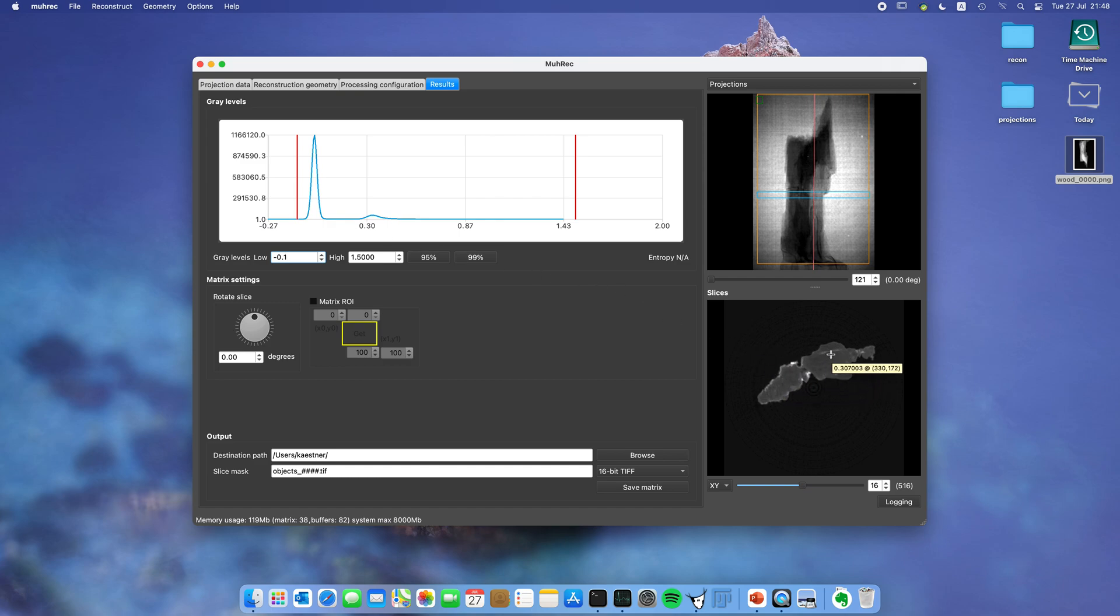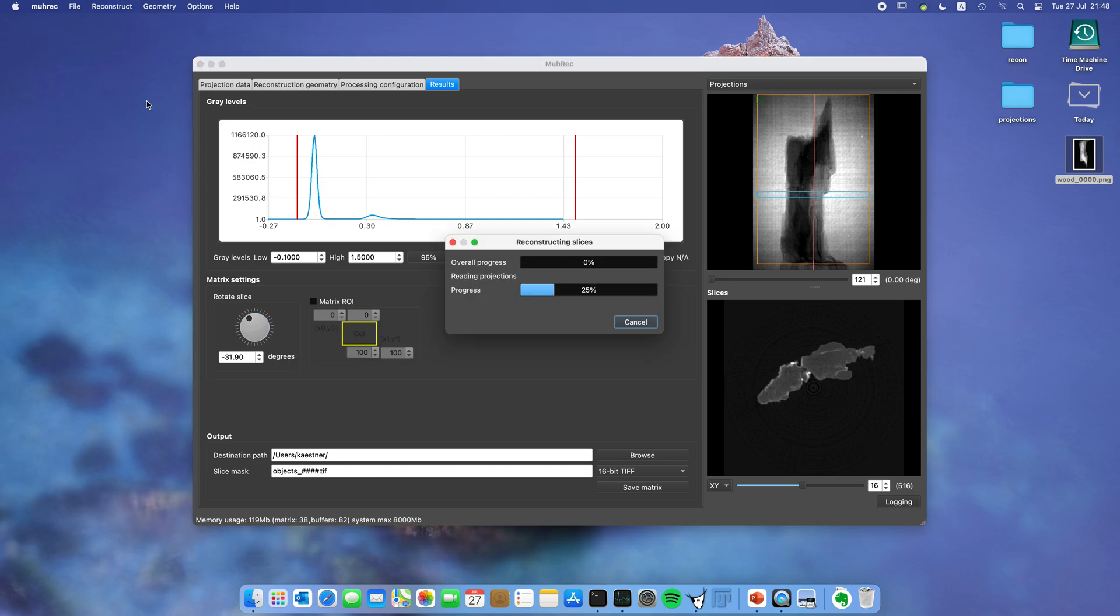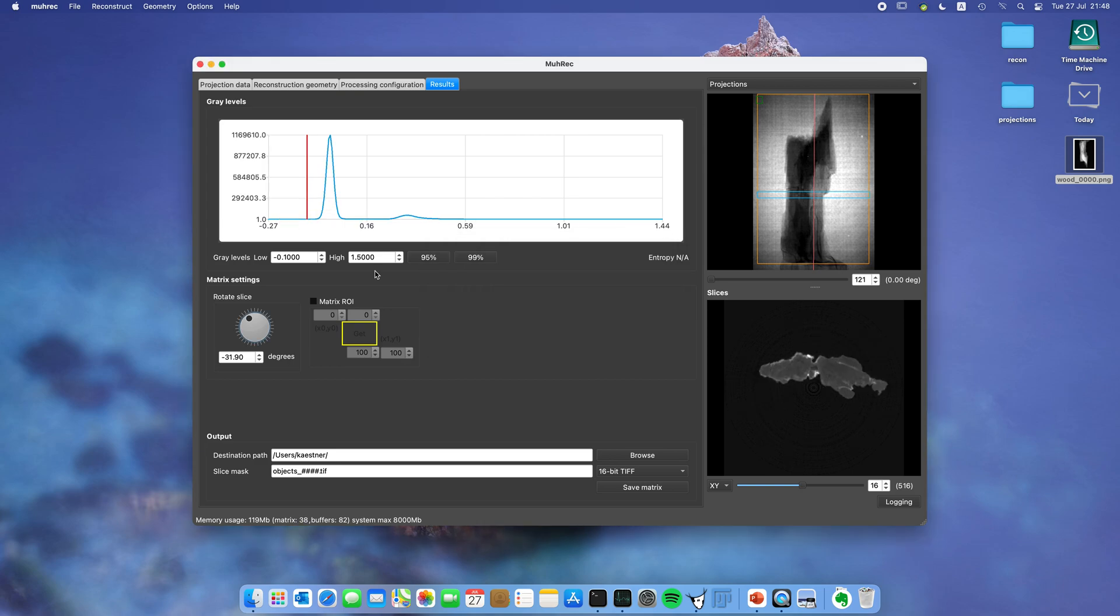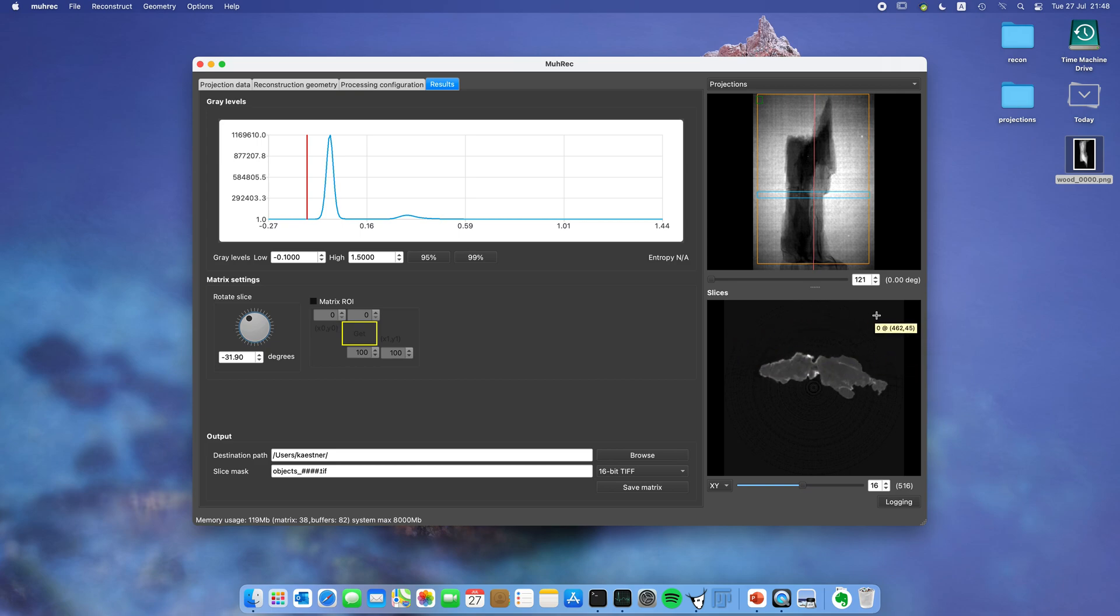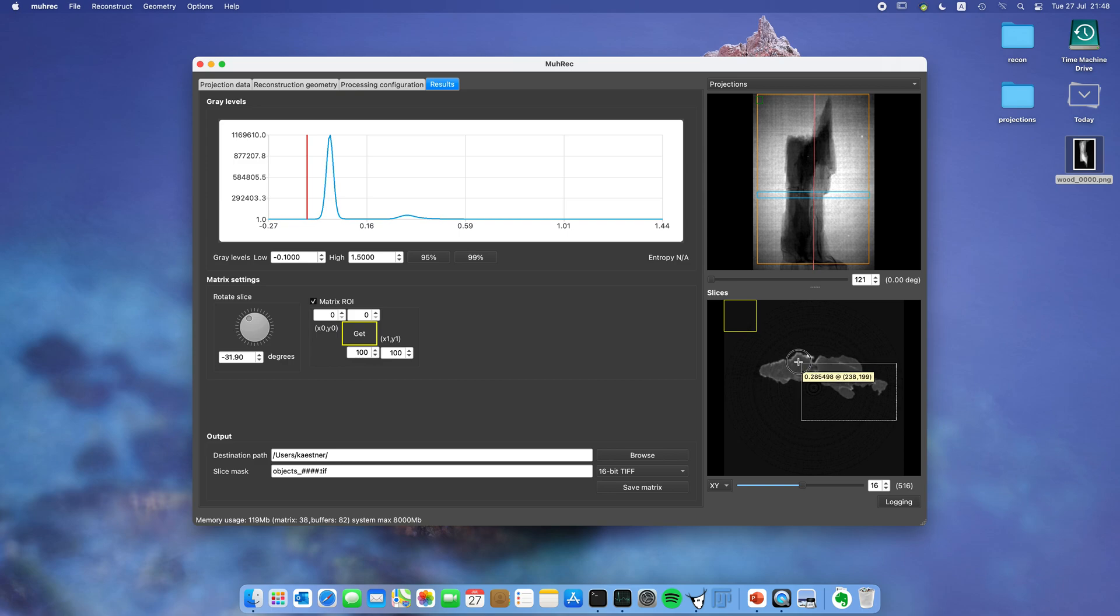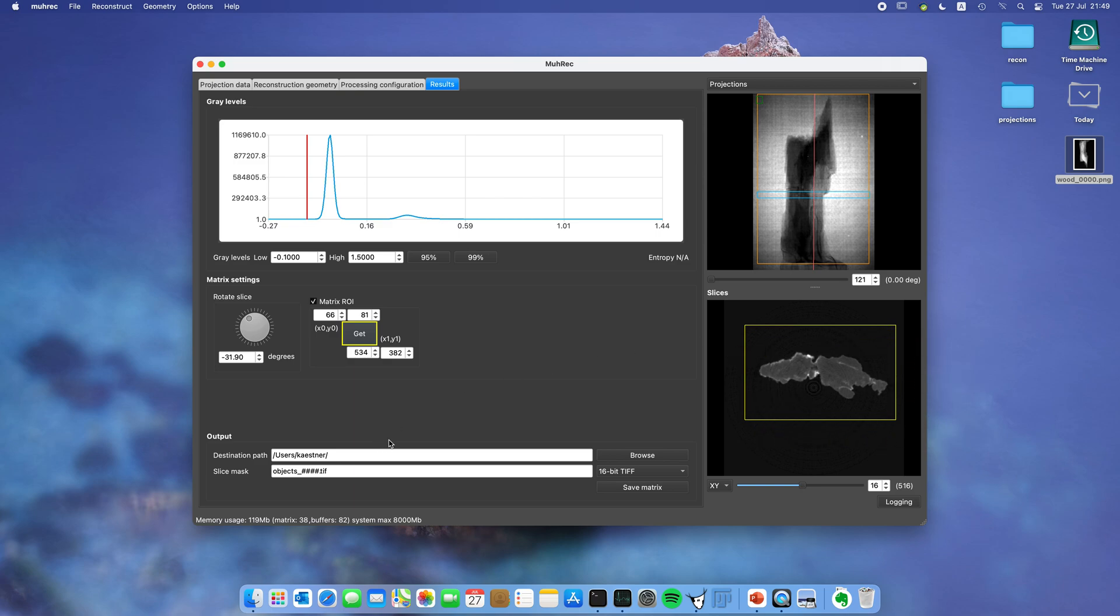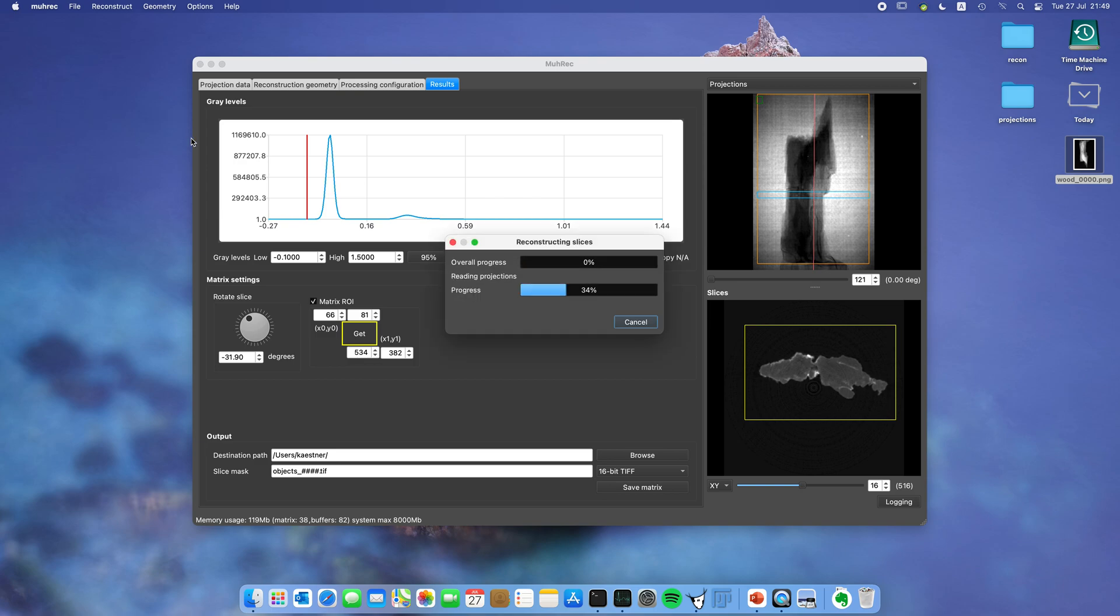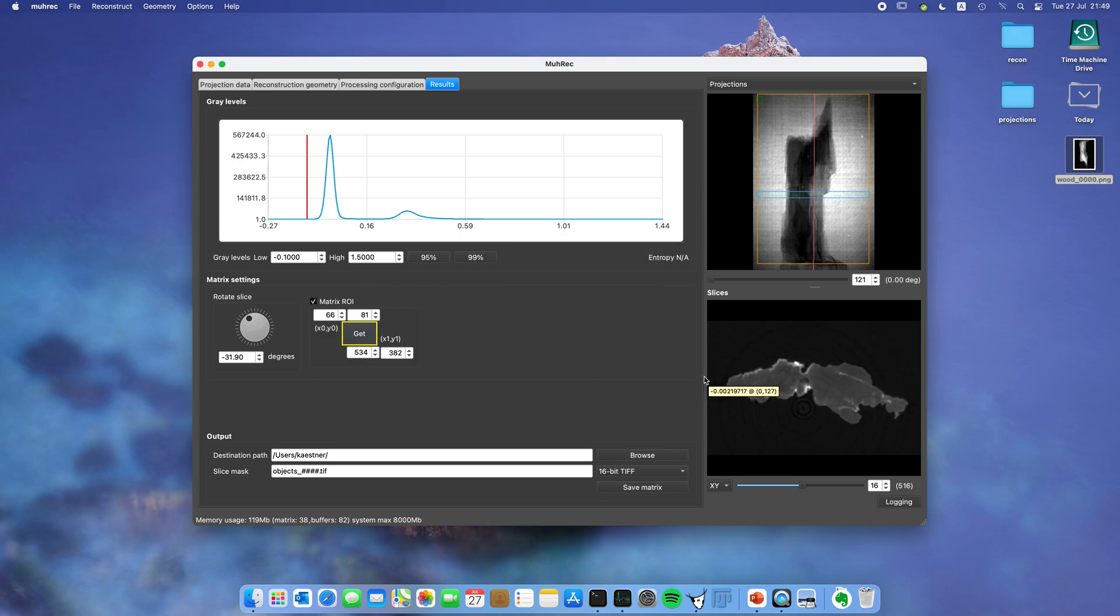You can see that this is rotated a little bit, so we want to change that. Let's do something like minus 30 degrees and start the reconstruction again. You can see more or less 30 degrees. The other thing is you can see there's a lot of space around the sample, so maybe you want to crop it. For that you can set matrix ROI. Again from the lower right corner mark a region. Click get and you can see this region is now yellow. Let's reconstruct again. Now you can see we got an image which has the size of the sample.